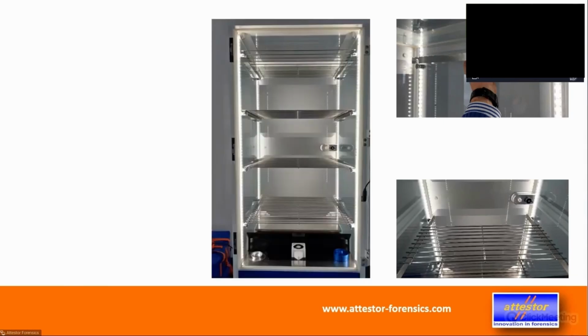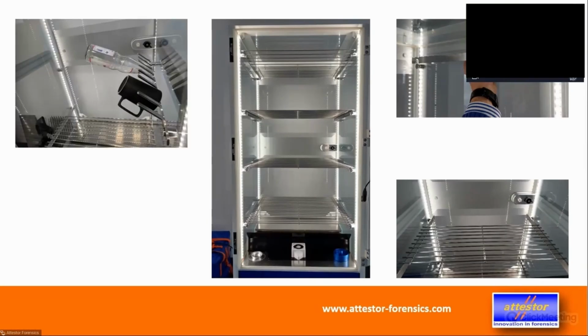In that size system, we have 3 layers in the center and one in the very top. Each of them you can put these side rails in and then put the standard shelves in. I'll show you them in a minute. You can leave off what you don't need, so you don't have to clean it.